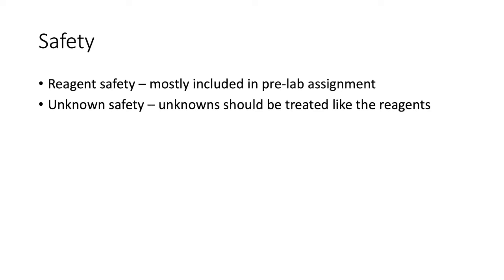We'll also be using a number of unknowns for testing, and some or all of these will be mildly toxic if ingested, and some or all of them may be mildly acidic or cause skin or eye irritation or damage. So you should take general precautions. You should avoid contact with the skin or eyes, and you should flush thoroughly with lots of water if you make contact with these unknowns.